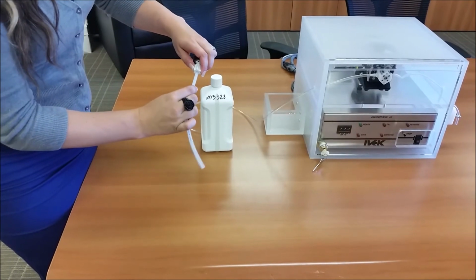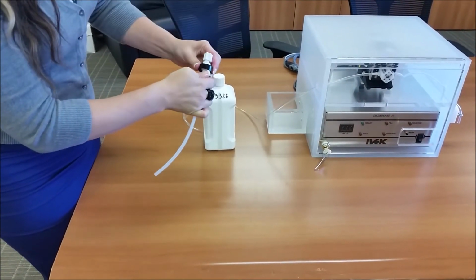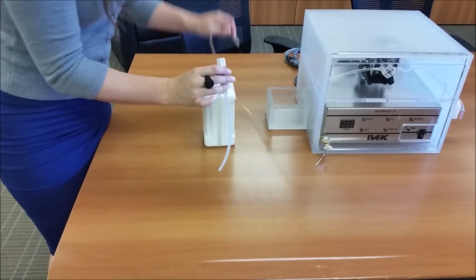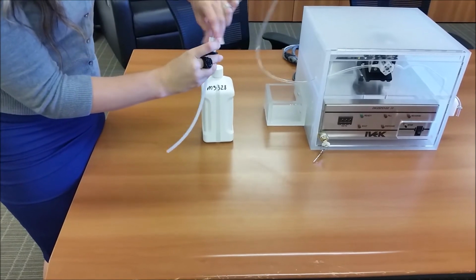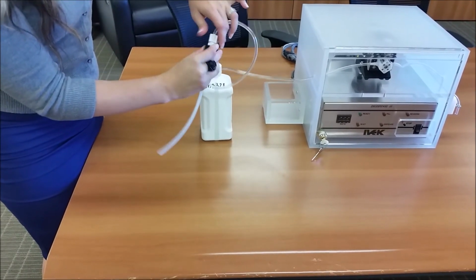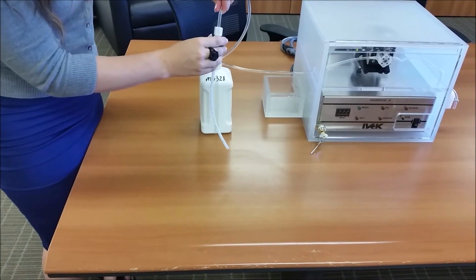Insert the straw into the cap from the bottom part until the first resistance is felt. Tighten the white screw to secure the straw to the cap. It is important that we don't go past the midpoint of the cap, as we will have to screw the tubing on the top side of the cap. Proper installation will ensure that we don't have bubbles on the line while testing with water or dosing.